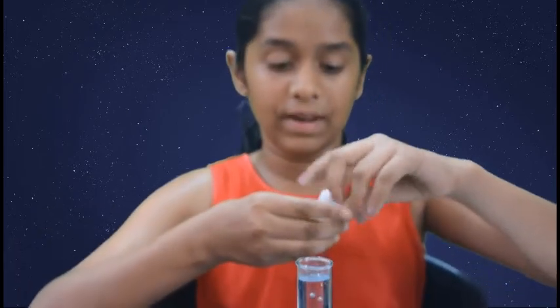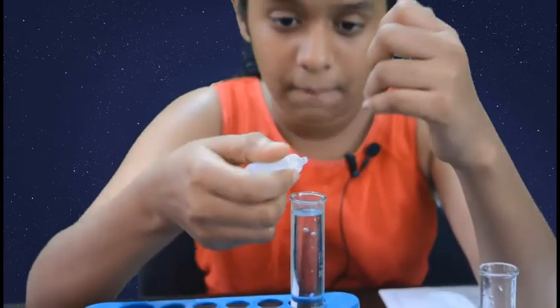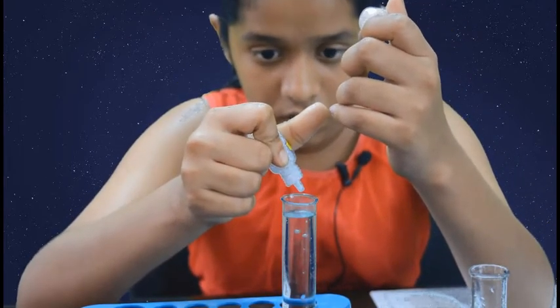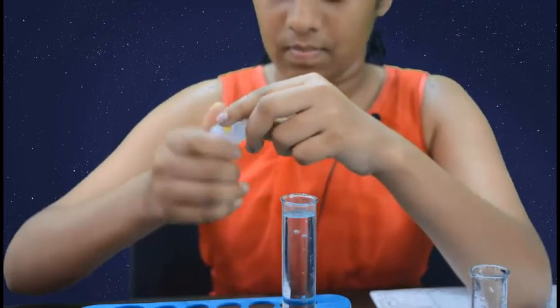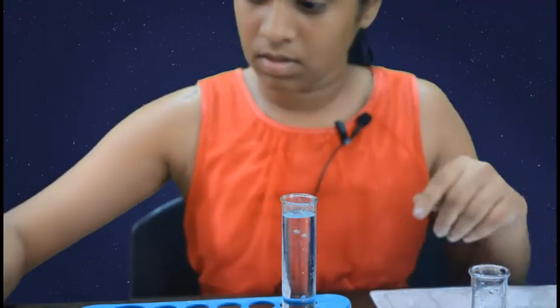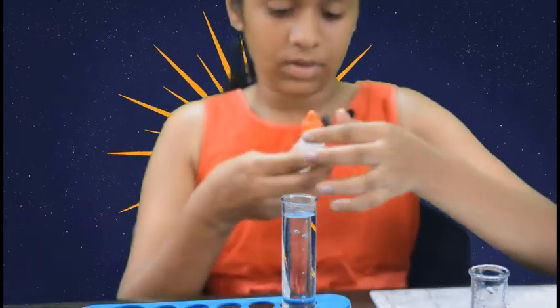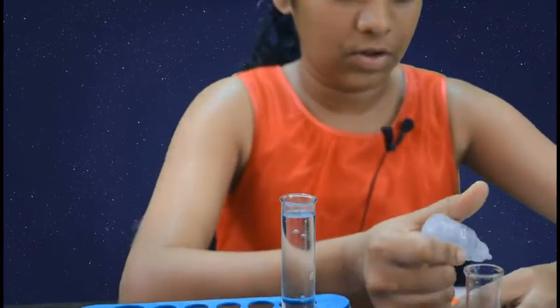First, add two to three drops of phenophthalein and prepare the phenophthalein solution in 50 ml of water. Now let's add two to three drops of sodium carbonate into the conical flask.